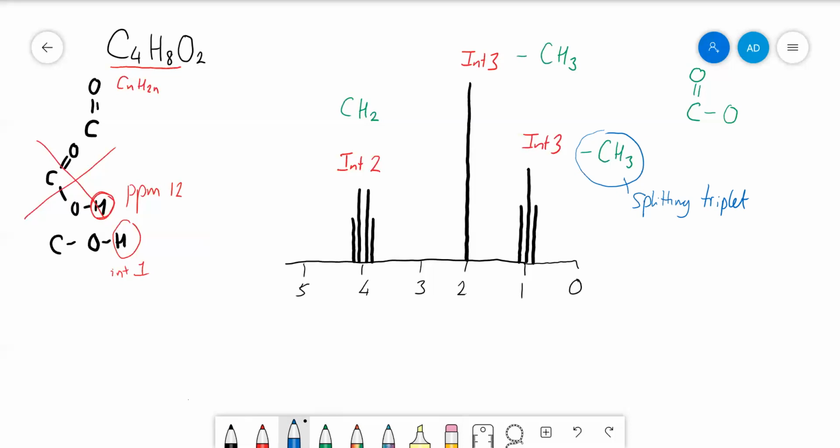So I think we can get these 2 little bits here, and we can say, right, we've got CH3, CH2. That CH3 is this triplet here, and these two hydrogens here are giving us this signal, and that's split into a quartet, isn't it? And it should be split into a quartet because it's next door to a carbon with 3 hydrogens on it. So we've definitely got that.